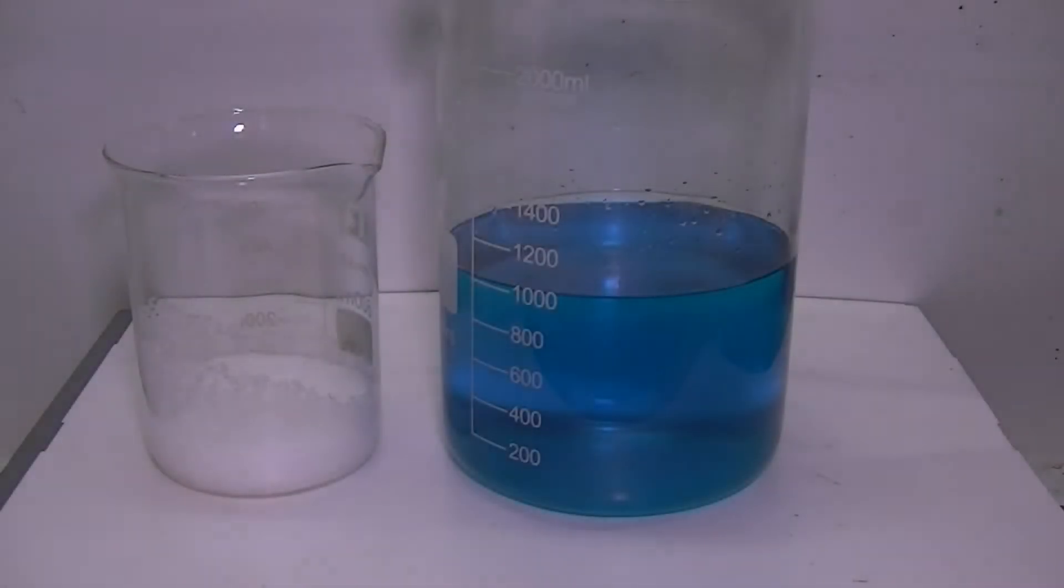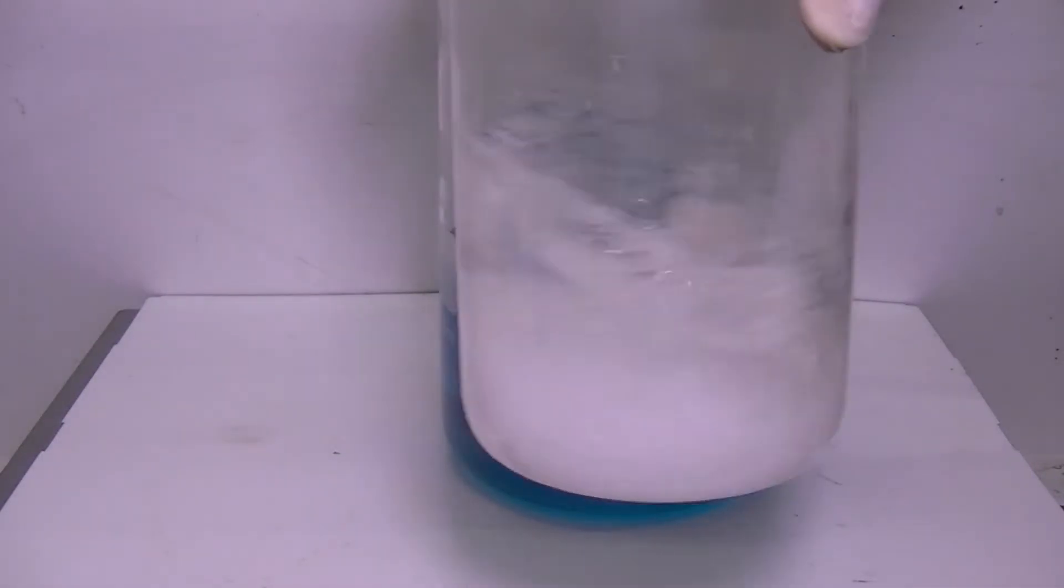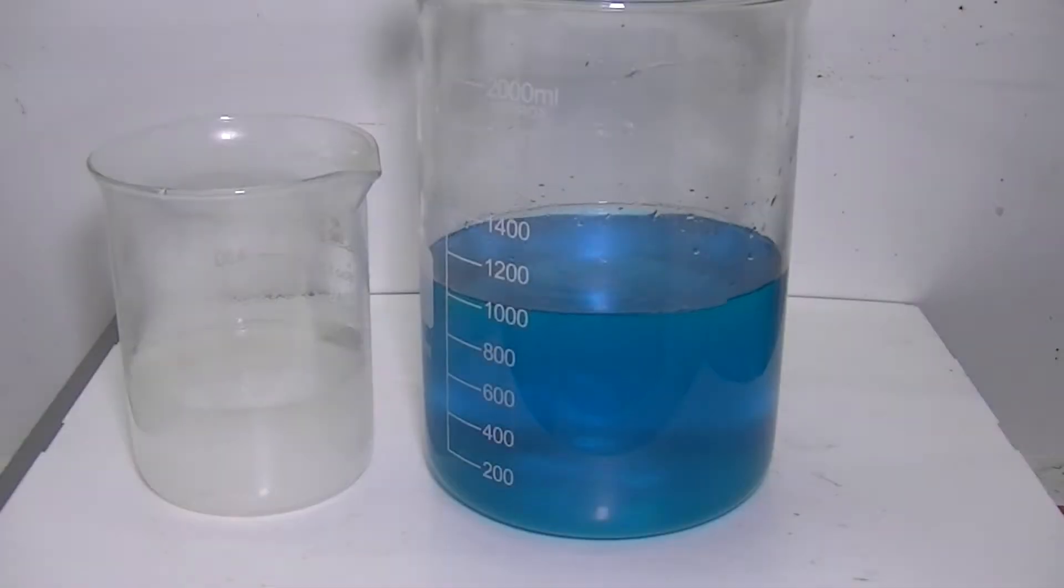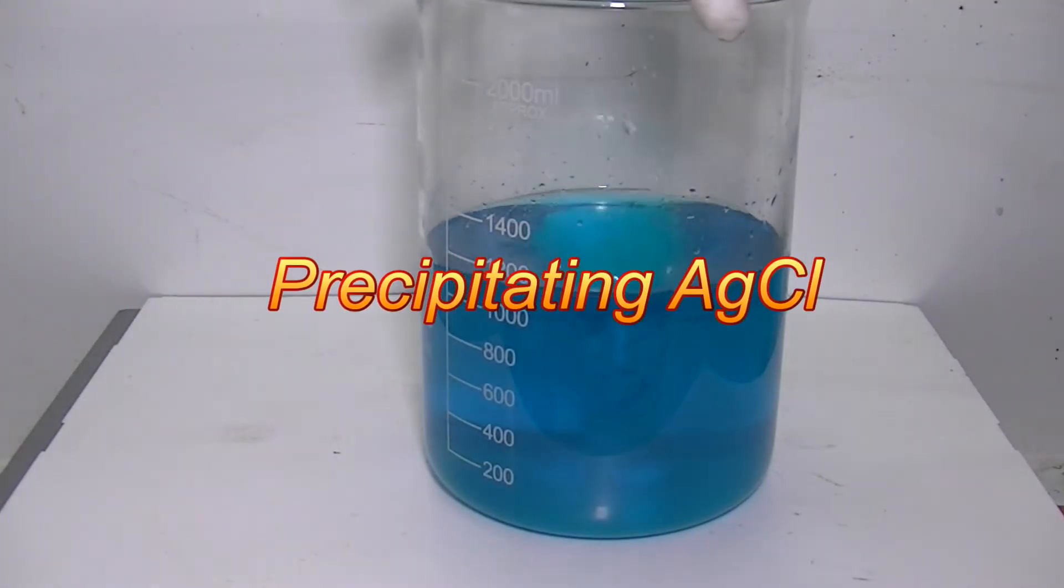Now that the silver nitrate solution is clear of any solids, it is placed on a magnetic stirrer and I'll begin adding a saturated solution of the calculated amount of sodium chloride. Silver chloride looks like cottage cheese and will precipitate immediately.